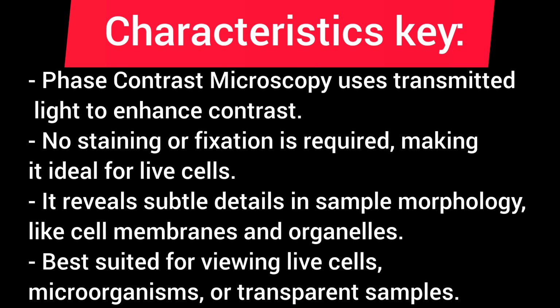No staining or fixation is required, making it ideal for live cells. It reveals subtle details in sample morphology, like cell membranes and organelles. Best suited for viewing live cells, microorganisms, or transparent samples.